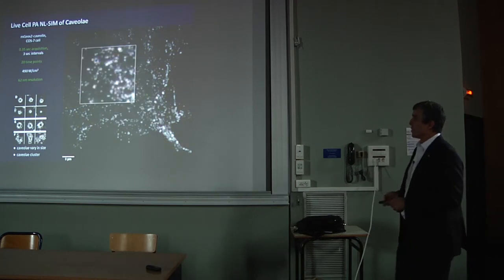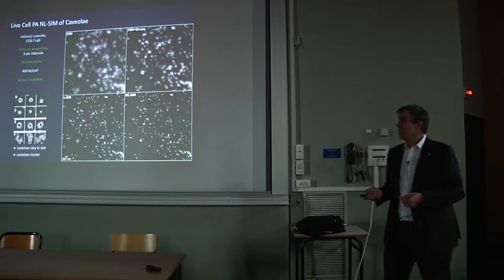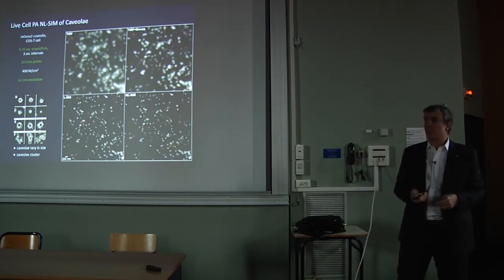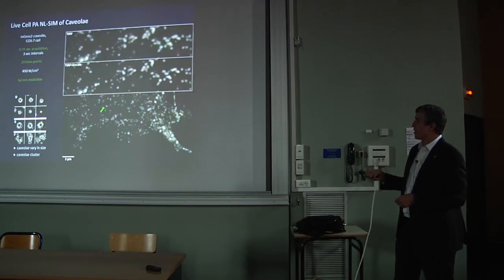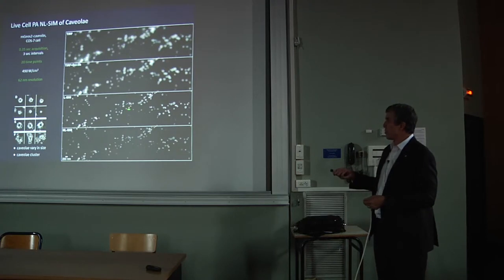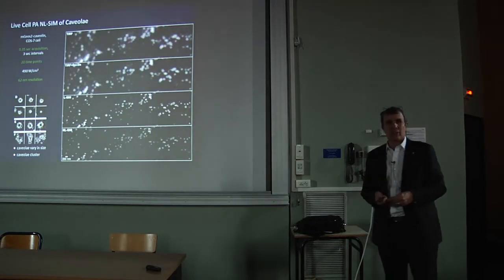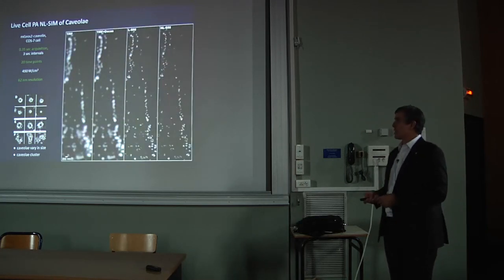So another example here is another method of endocytosis, bringing cargoes in the cell, through little pits called caveolae. And this is showing the resolution improvement from diffraction limit through linear SIM and nonlinear SIM. The caveolae are so small that most of them are barely resolved or not resolved even with linear SIM, but become resolved with the nonlinear SIM.